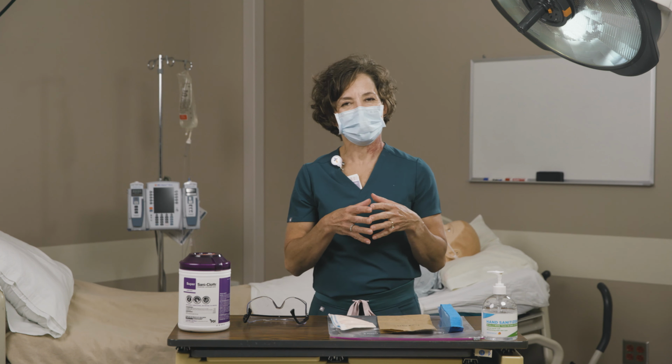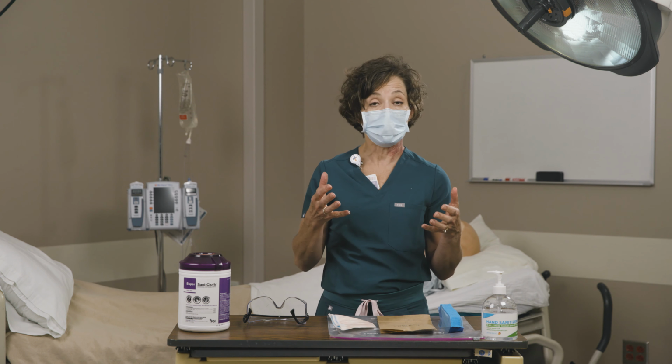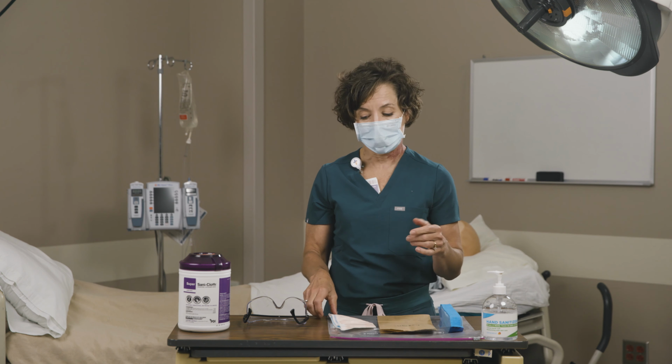All right, now we're going to talk through some decontamination and conservation techniques for different pieces of PPE, as we have all been practicing reuse of a lot of products. So first, let's start with our N95 mask.